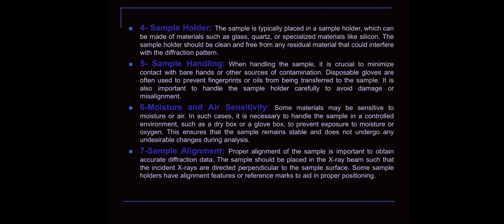Fourth, sample holder. The sample is typically placed in a sample holder which can be made of materials such as glass, quartz, or specialized material like silicon. The sample holder should be clean and free from any residual material that could interfere with the diffraction pattern.